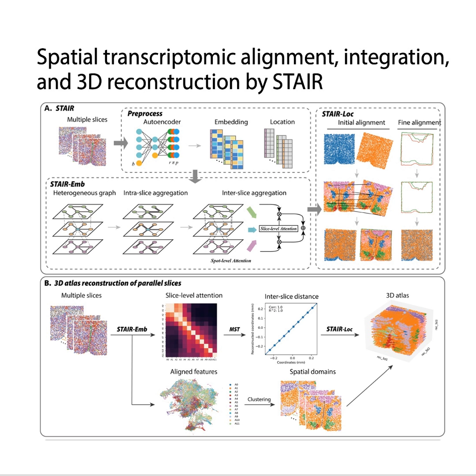That's it. In previous computational solutions, there were really just partial fixes, weren't they? Some, like PRECAST or PASTE, were great at 2D alignment, but only within a single batch. And others that tried to do 3D, something like STitch3D, they had a major catch. They required you to already know the z-coordinates. Which kind of defeats the purpose if you're trying to build a new reference atlas where those coordinates are missing, especially if you're pulling samples from multiple different patients. Precisely. The field was waiting for a truly unified end-to-end solution, something that could handle the molecular integration and the spatial alignment. But the real key, you had to figure out that missing z-coordinate completely unsupervised. Relying only on the data itself.